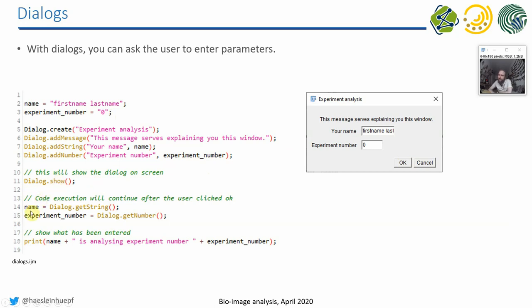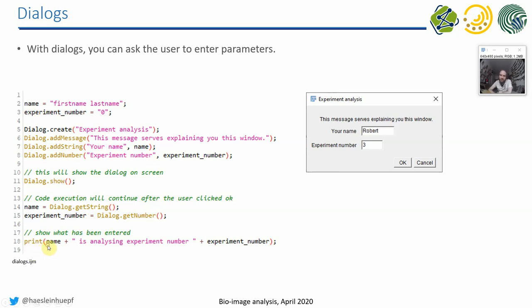As soon as the user clicked on OK, I can read out the variables again. For example, if I say name equals dialog.getString, it goes in the same order as we added the fields here, we have to read out the fields over there. So that's quite convenient in order to have certain parameters entered in a program. And then finally, we can just do a print statement, for example, print out what the user just entered.